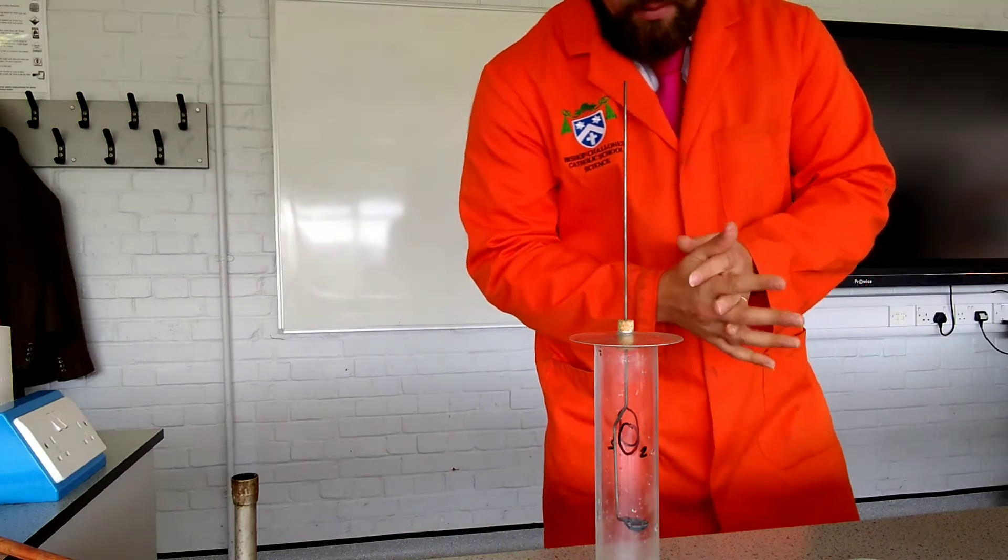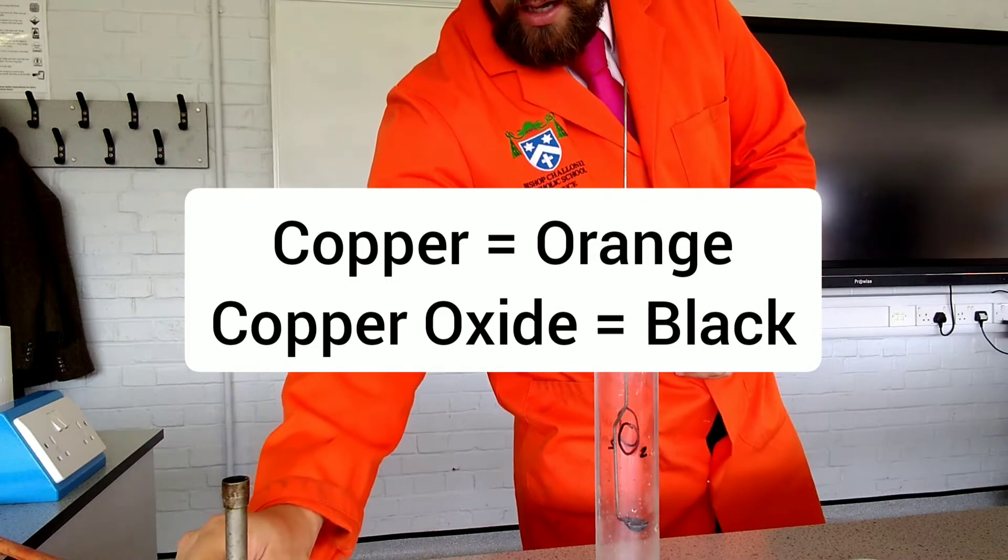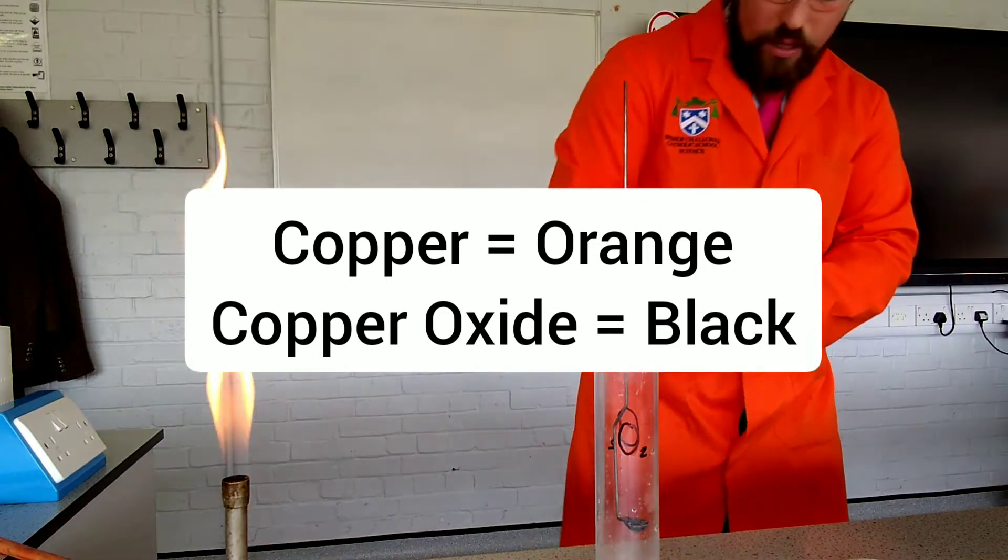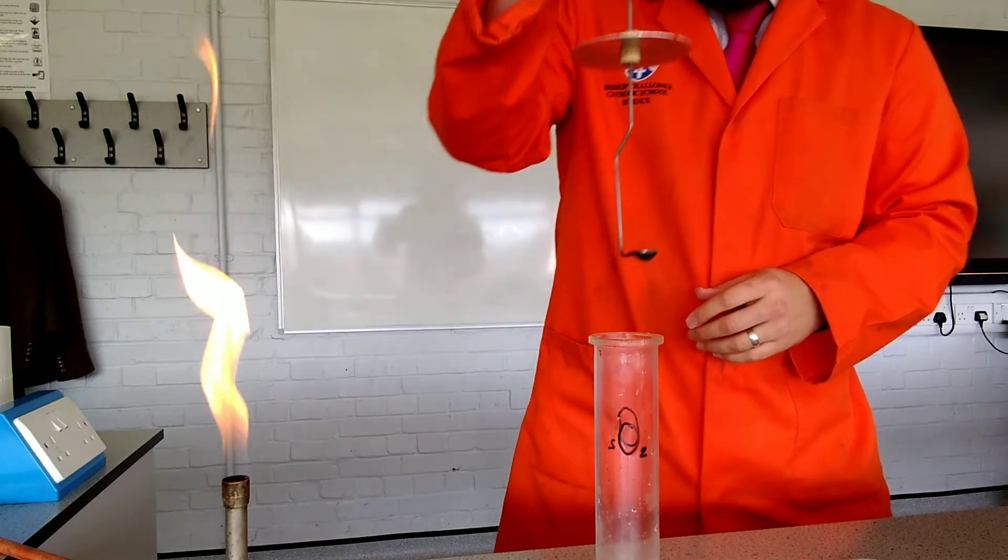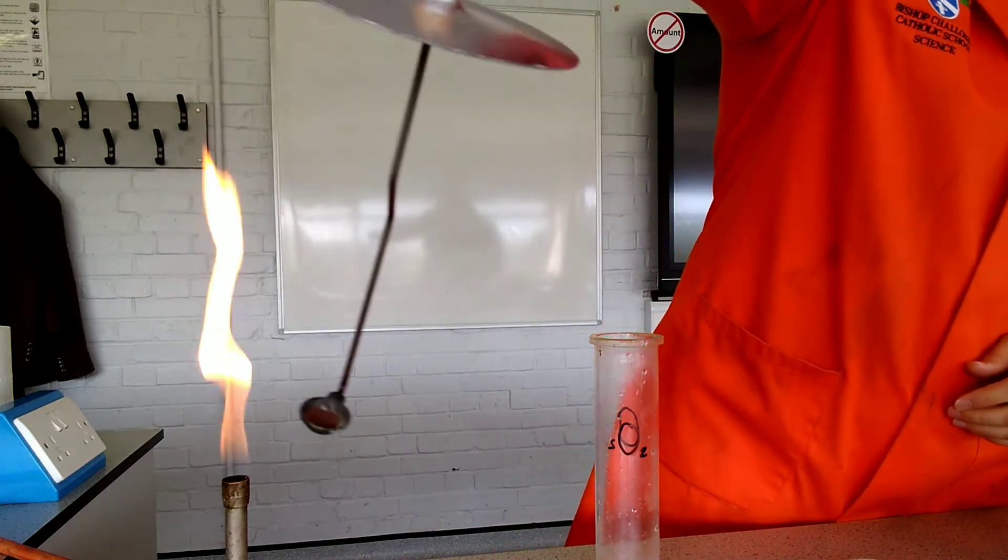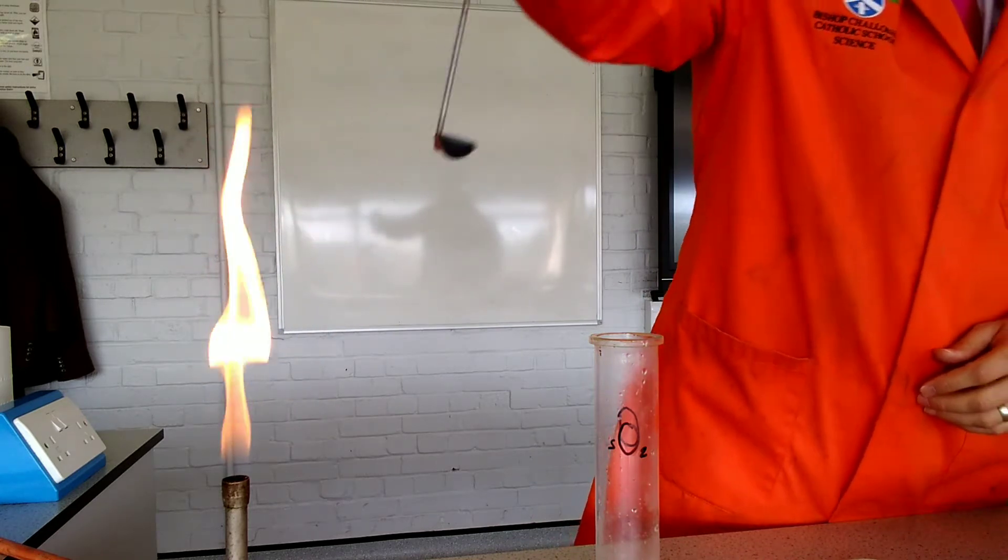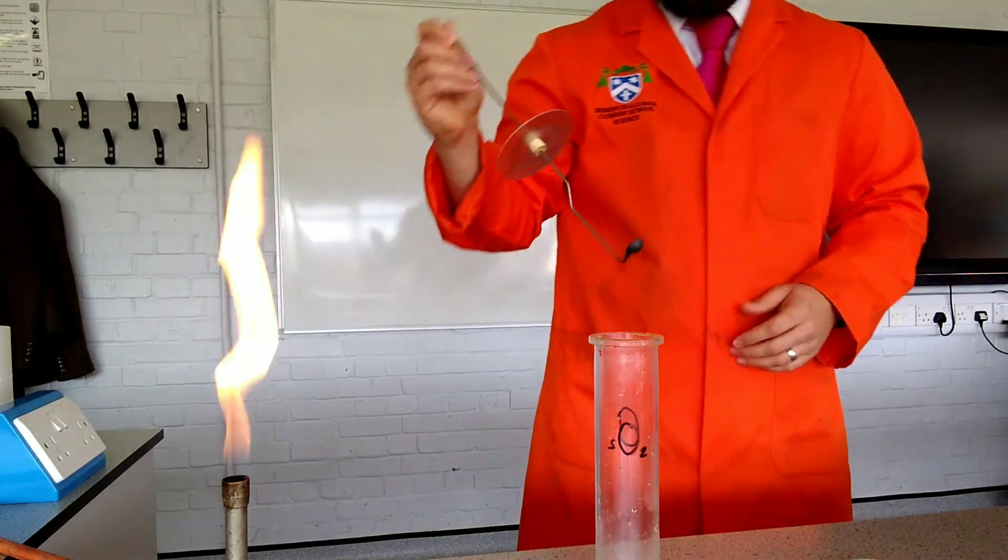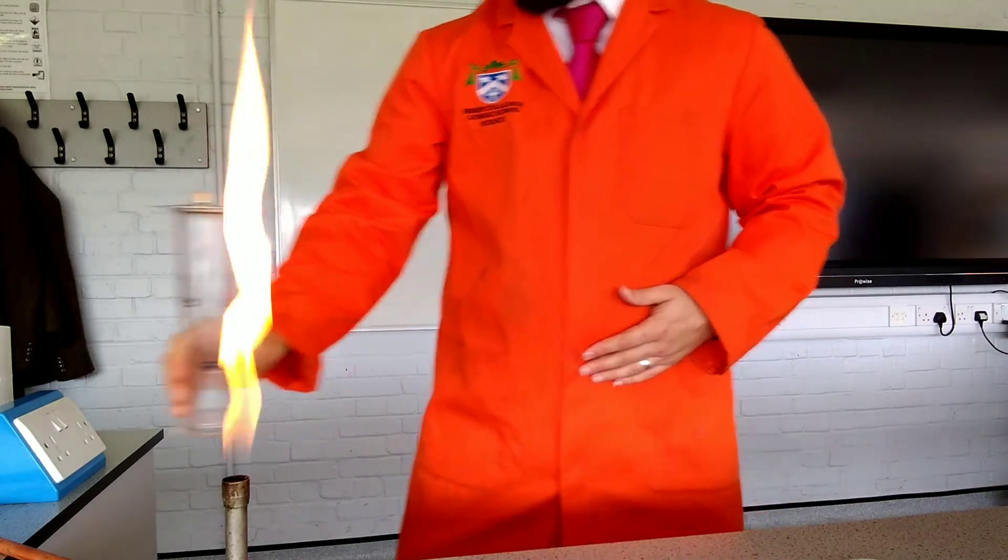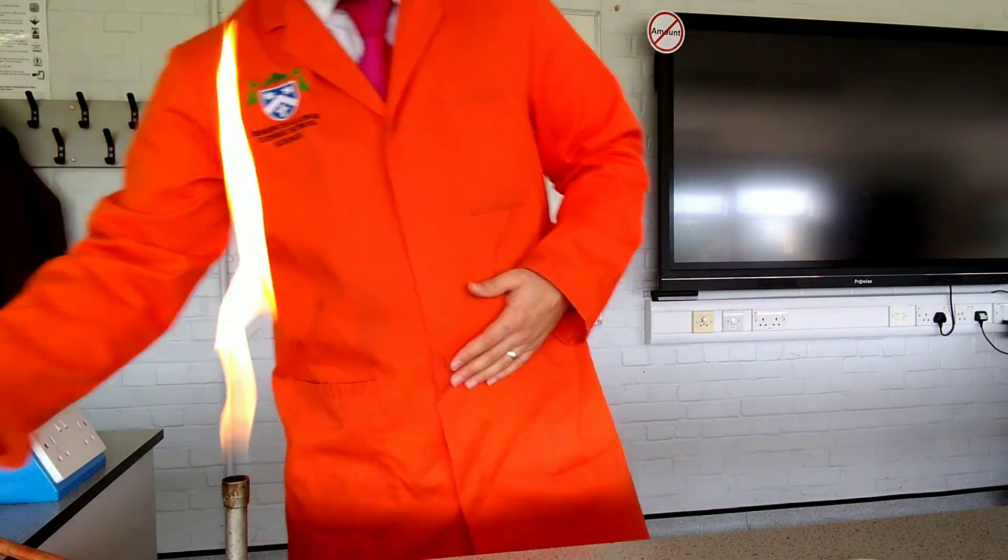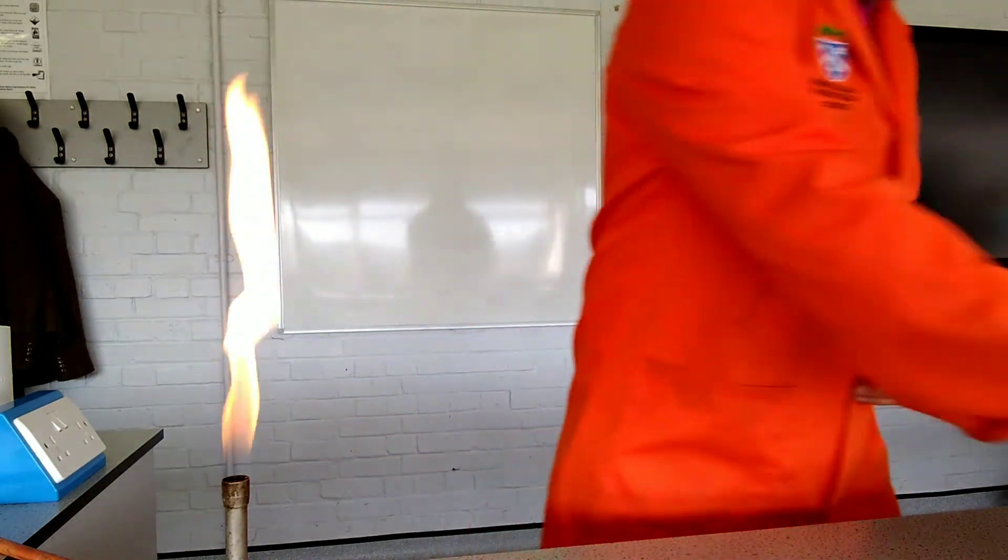So copper is pretty unimpressive. It does react, and it reacts with the oxygen here. Now, copper doesn't burn in oxygen. That copper we started with was nice and orange, and this copper we've ended up with is blackened. So copper and oxygen, pretty unimpressive. It doesn't burn in oxygen, but it will react with the oxygen to produce copper oxide, which is black in color.